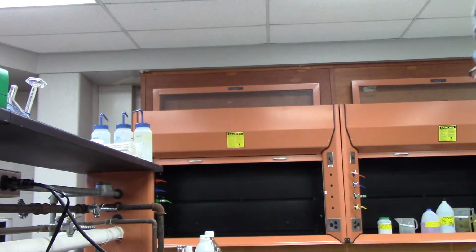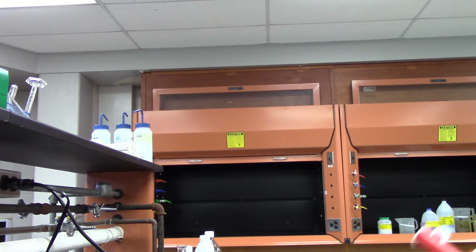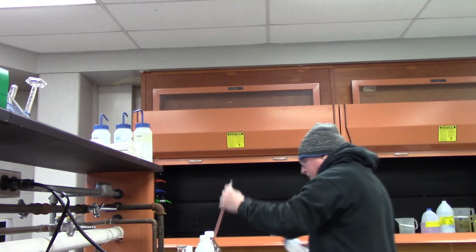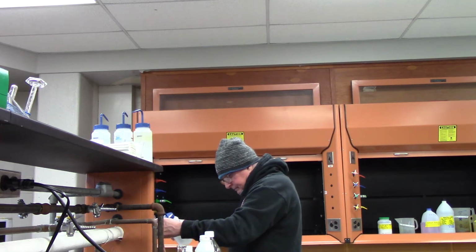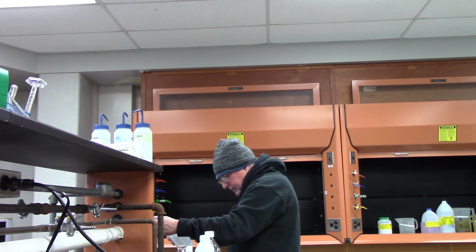All right, so I got 25.00 mils on my stock. What I'm going to do now is I'm going to rinse out the pipette with deionized water. Trust that I'm doing it. Doing it in the sink. Because we're going to be using it again.